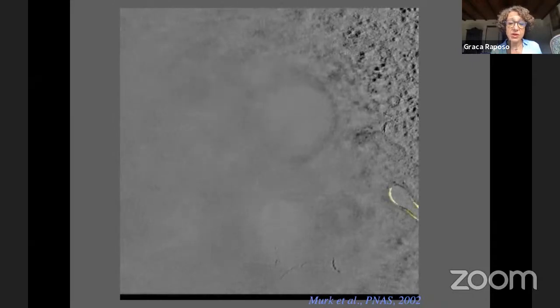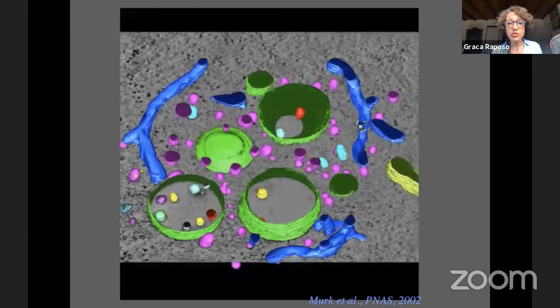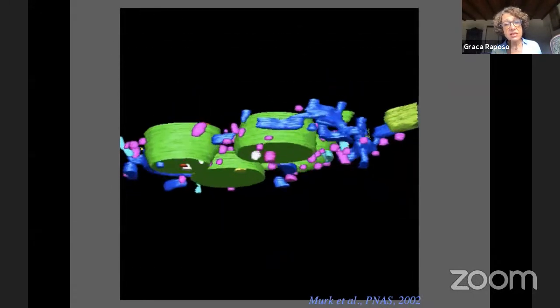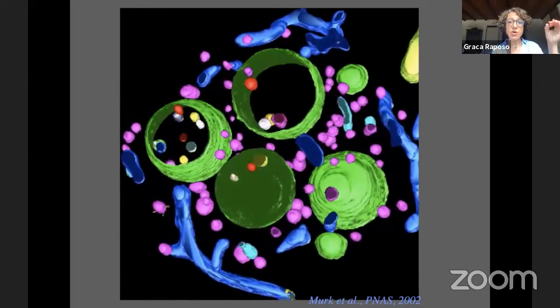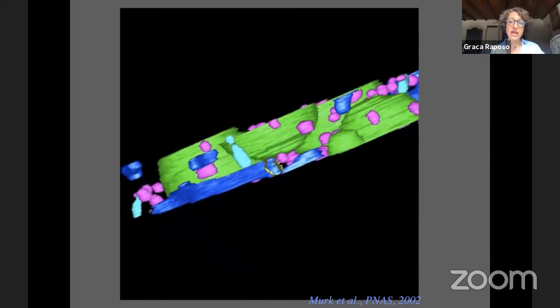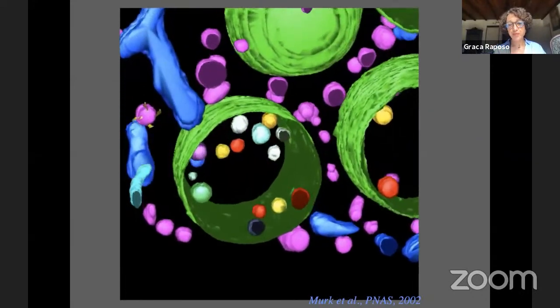These are multivesicular endosomes in B lymphocytes. Again, this is one of my favorites. This was from the lab where I did my postdoc in Utrecht. And this was extremely important to show that these vesicles that you have in multivesicular endosomes are vesicles and not merely tubules that are still connected to the outer membrane of the endosome.